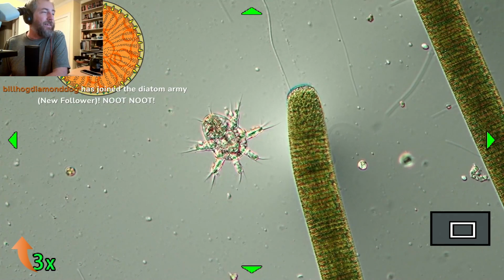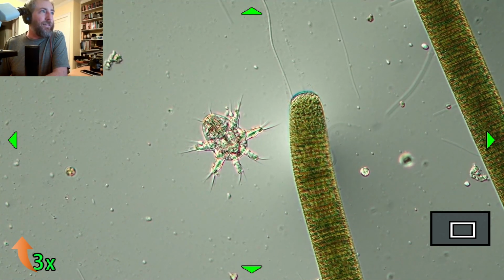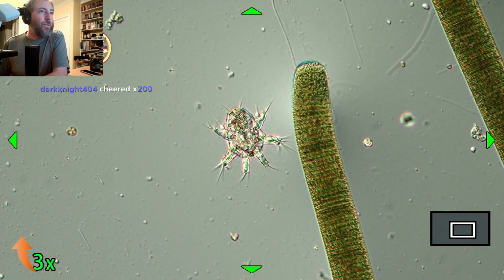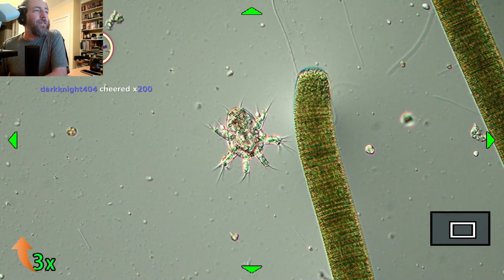Pretty fast. You can see the Oscillatoria is actually moving again. So people think that algae just kind of sit there, but a lot of algae are partially mobile or very mobile. Thank you for the cheer, that's amazing.